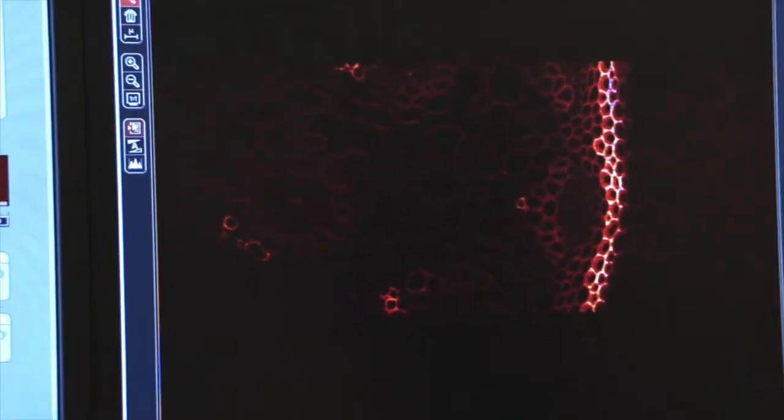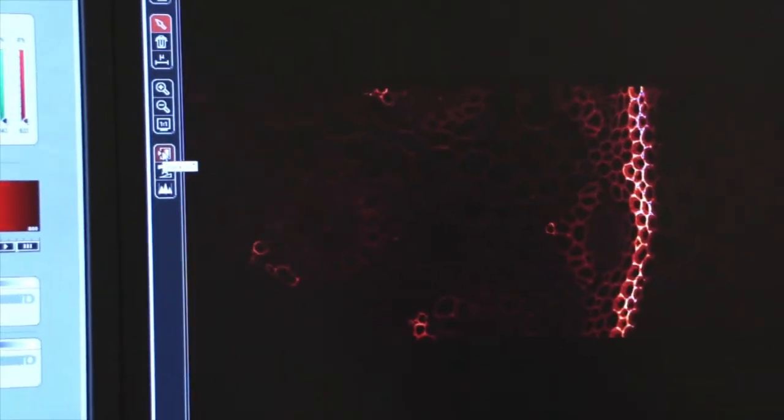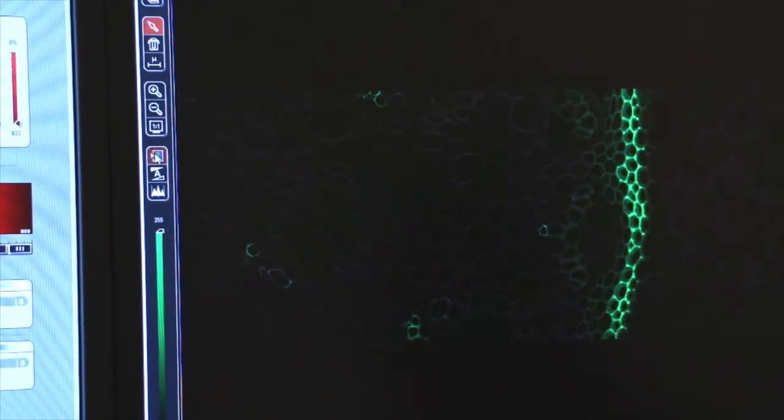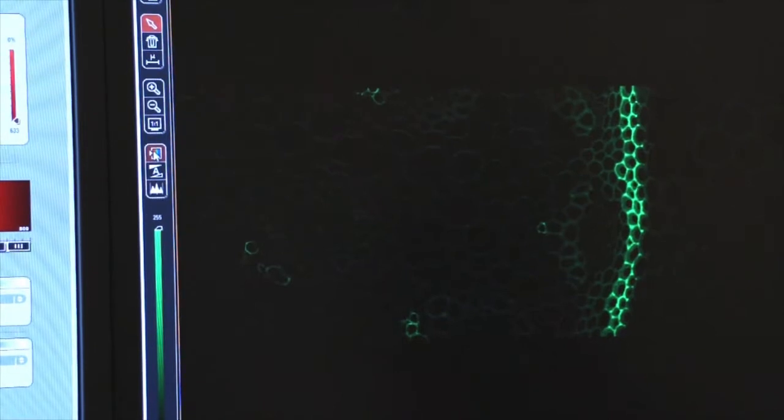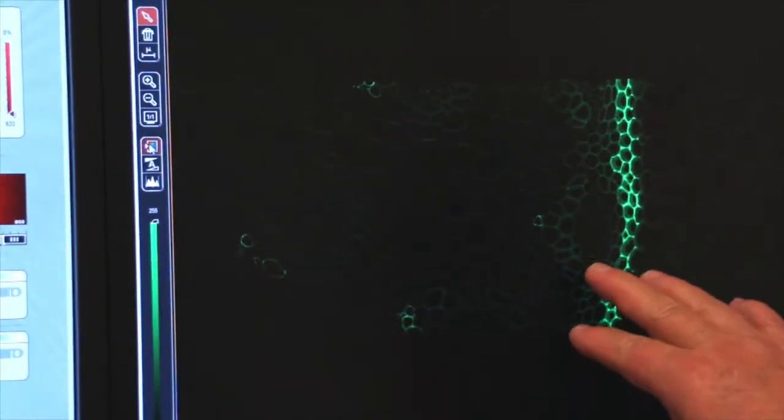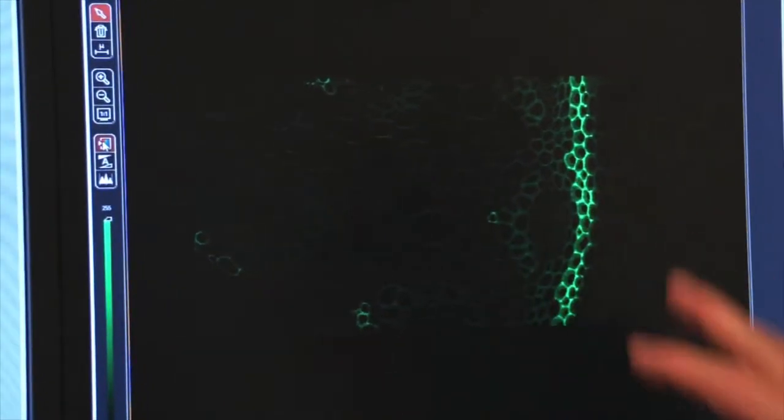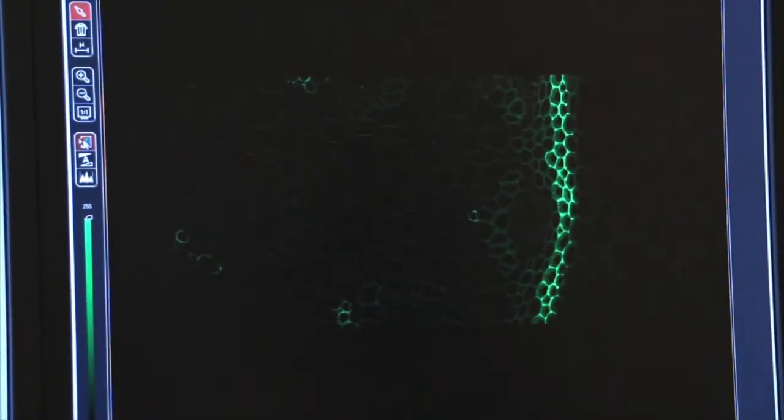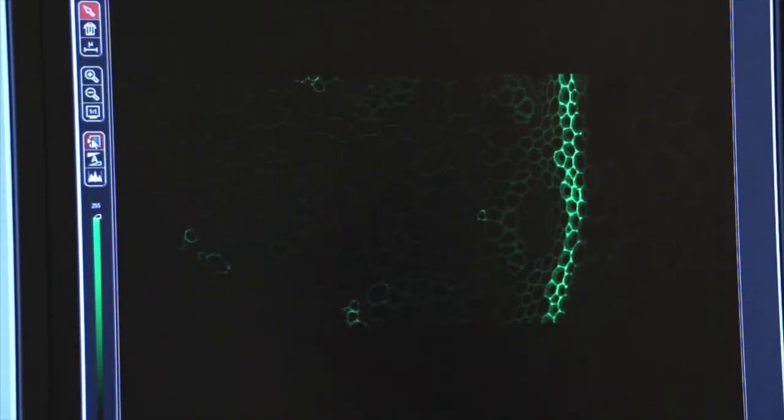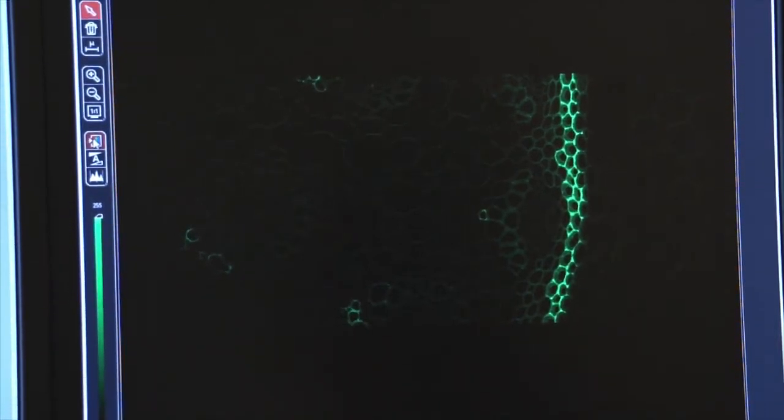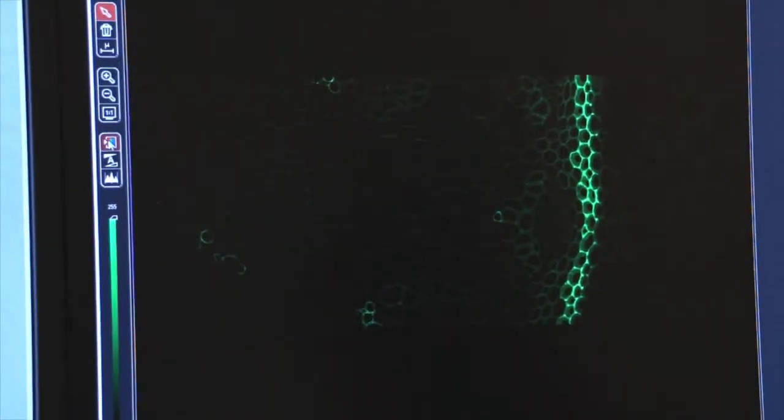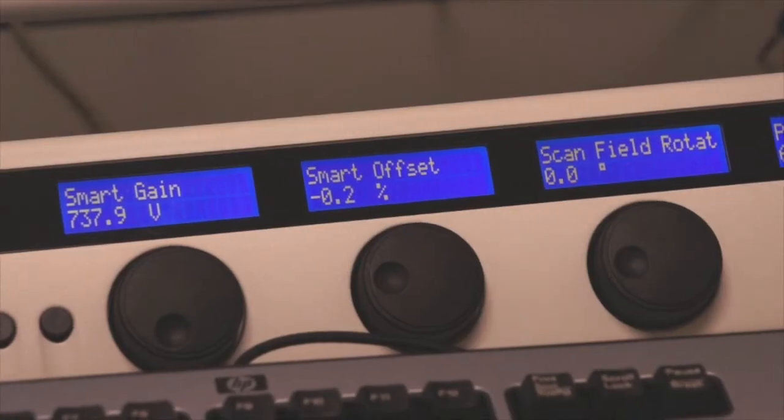And now you can see my image nicely illuminated and my smart gain and my offset are set where I should have them.